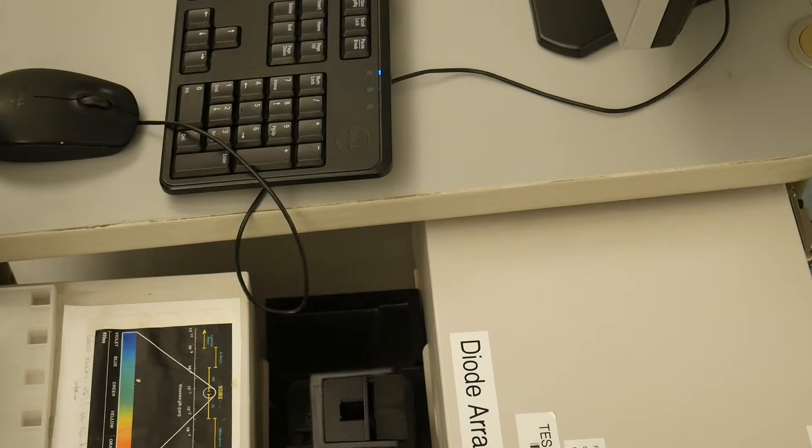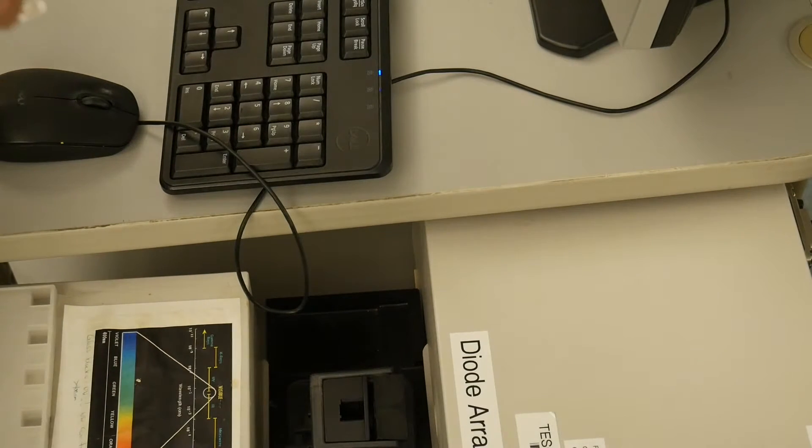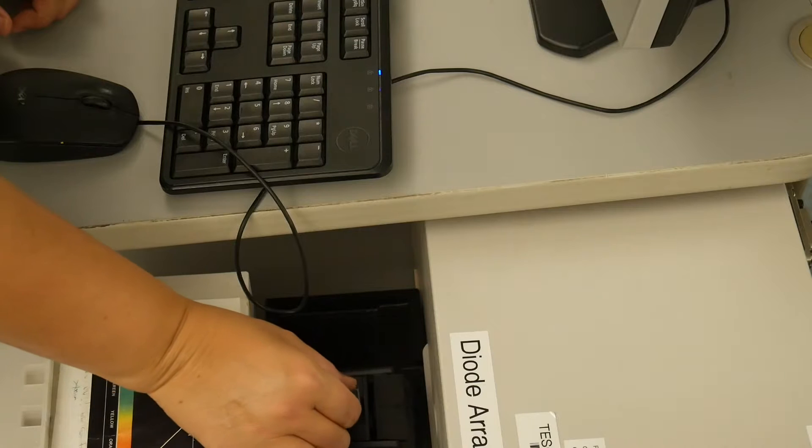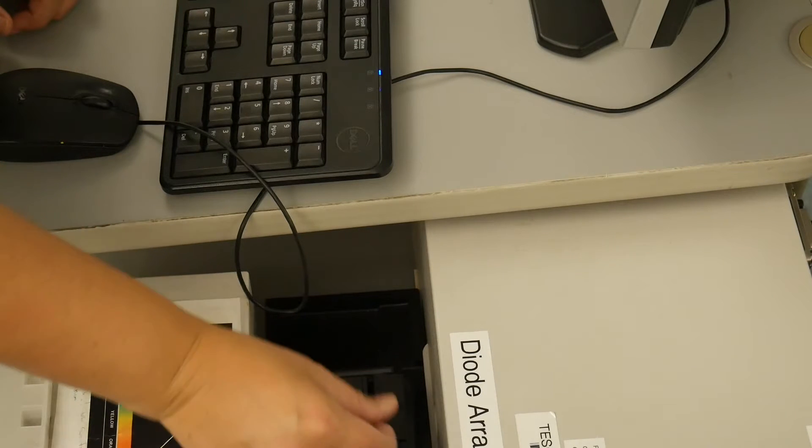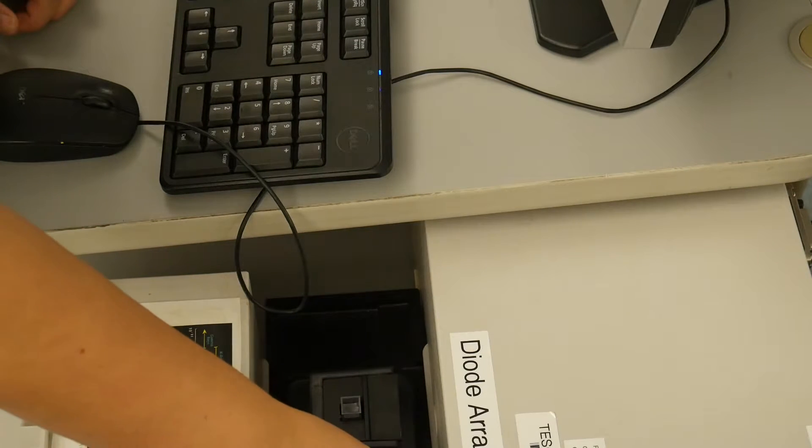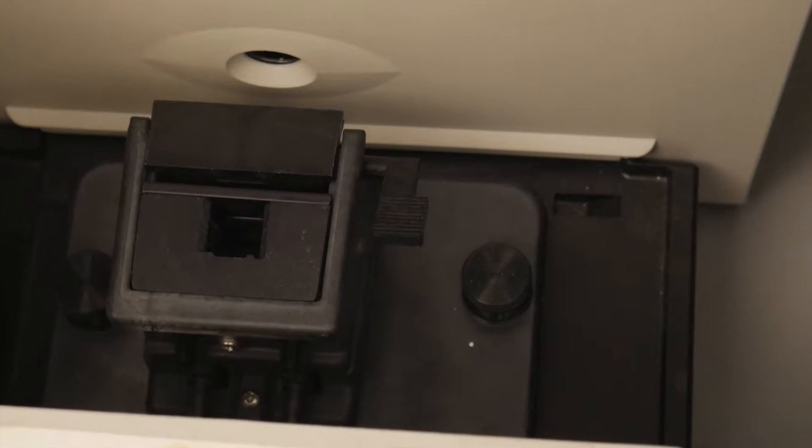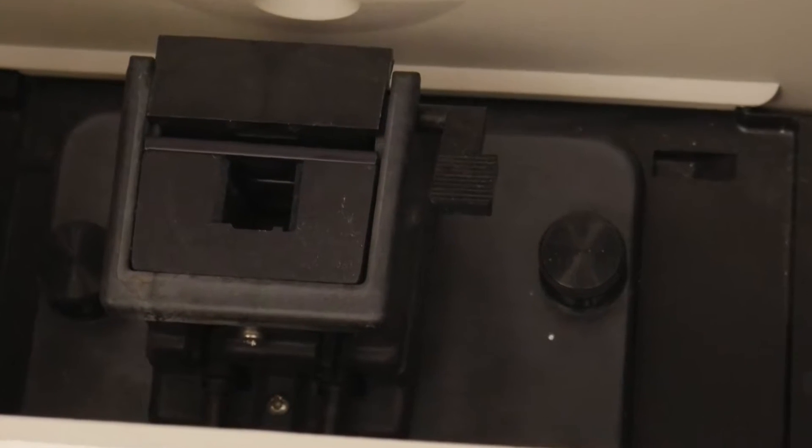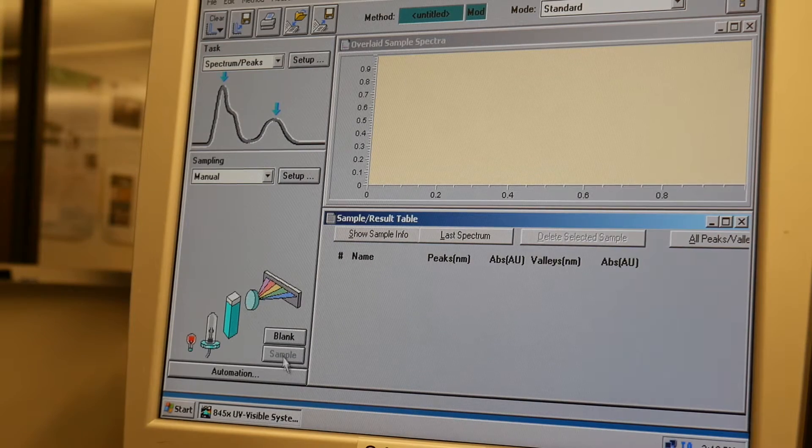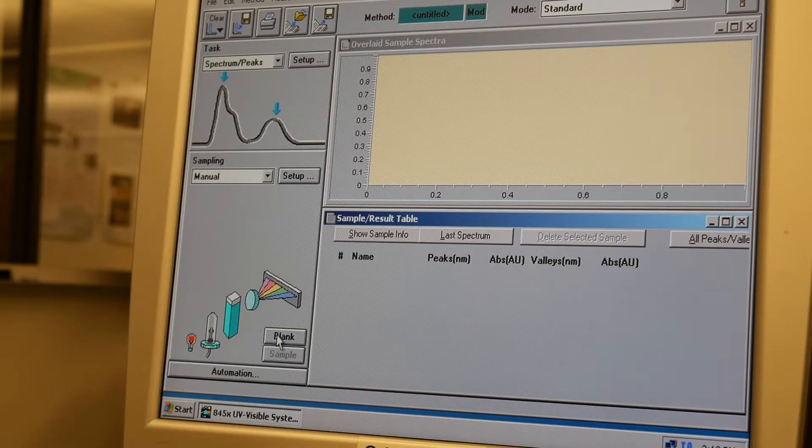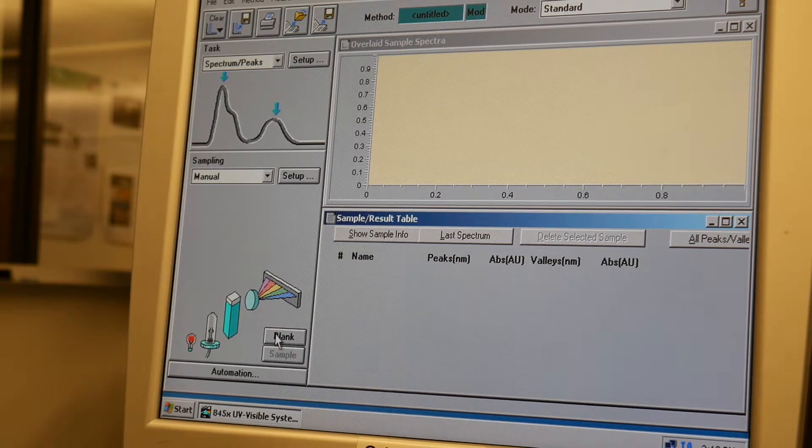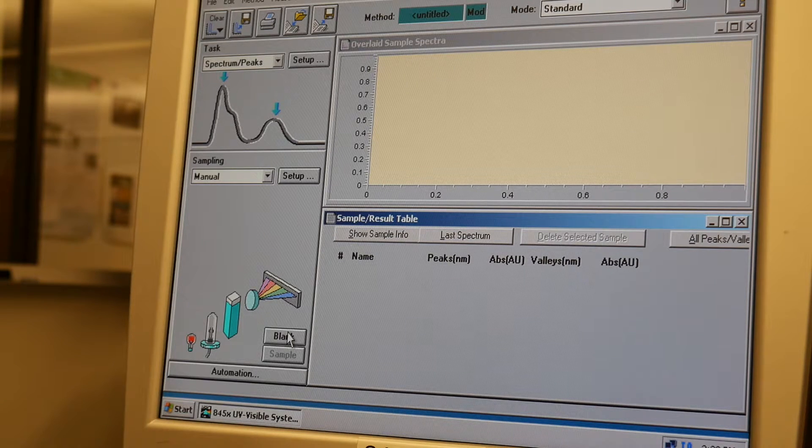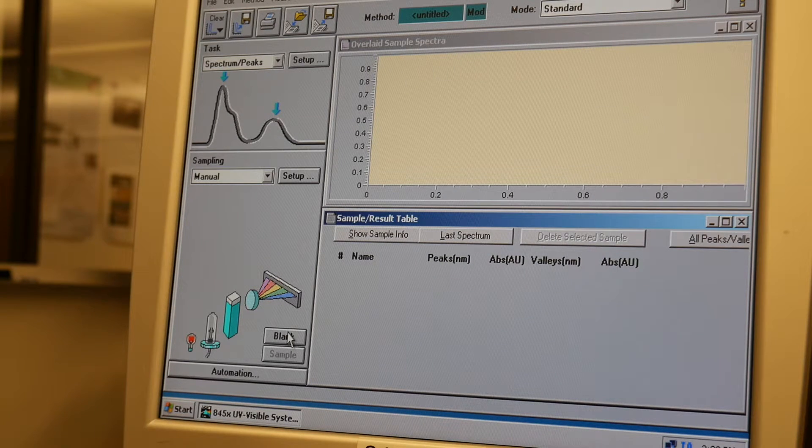So back to our newer spectrophotometer, take the cuvette, place it with the arrows lined up with the light path, and then flip the lever to lock it in place. There is a button right here to blank it. If you have one of the newer models, then you can just click on the blank button.